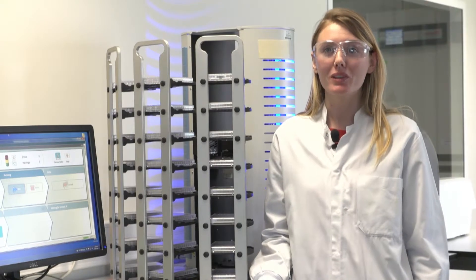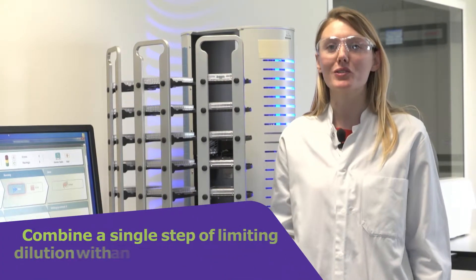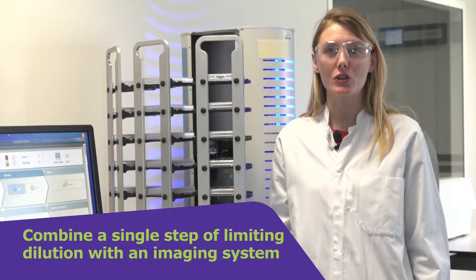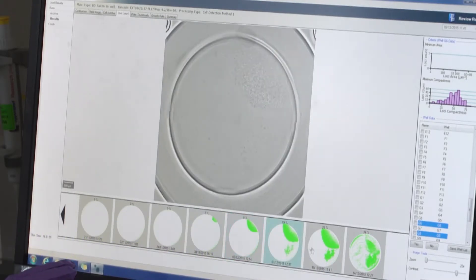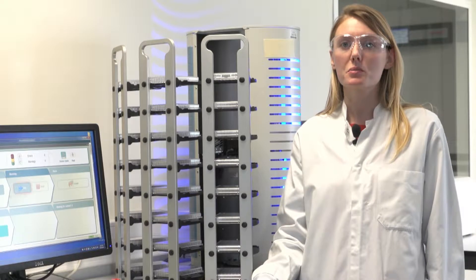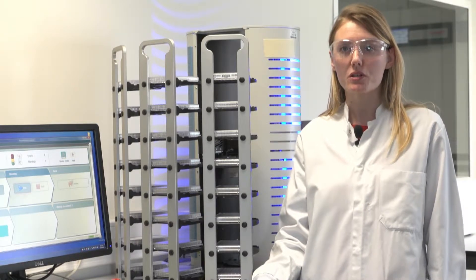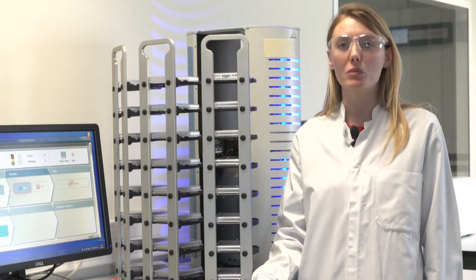To ensure the monoclonality of the final lead clones, we have decided to combine a single step of limiting dilution with an imaging system. The imaging system allows to get a picture at the zero of each well after cell isolation. When growth is observed in a well, the first picture indicates if originally the well was containing one or more cells.